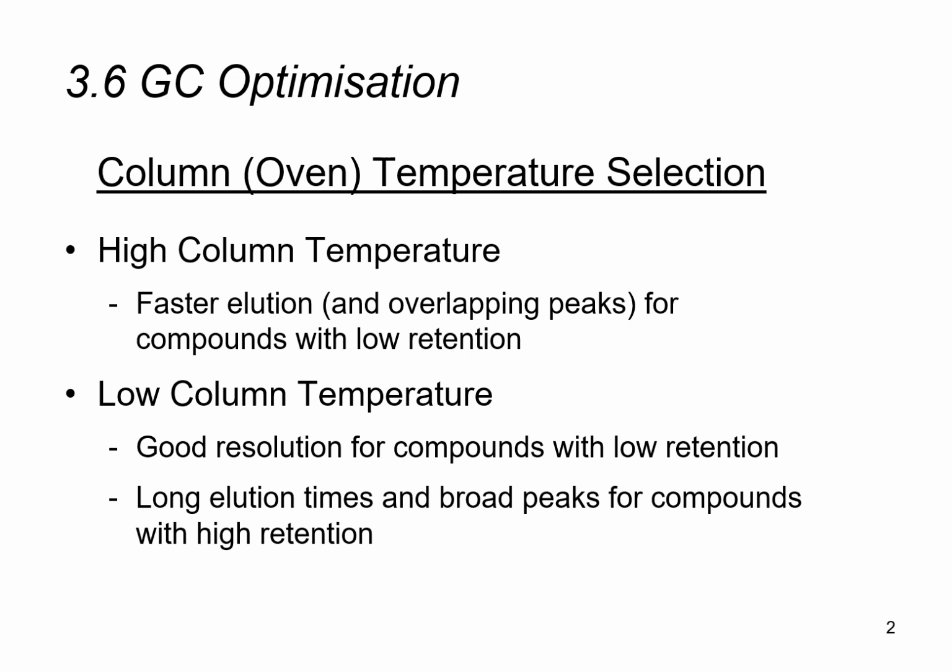So the key issue we want to talk about here is the effect of temperature on elution rate. So the thing we must remember is that when we have a high column temperature, the peaks are going to elute faster. If we have a high column temperature, the various chemical components will not be interacting with the stationary phase as much, so you'll just be interacting very little, and this will lead to generally faster elution for all the components. The opposite is also true.